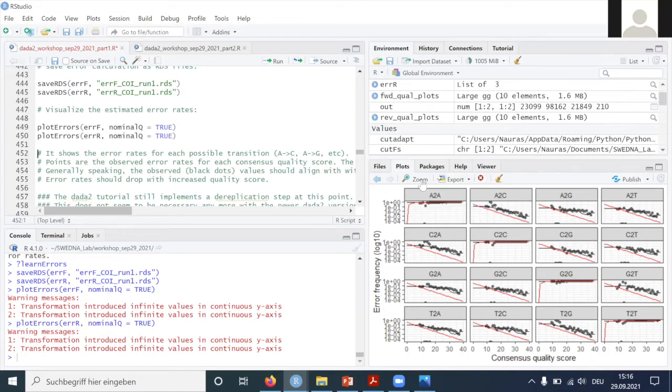I've looked at them. You're absolutely right, no one actually ever reports this, but I think it's critical to at least check it out. My guess is that you've only run one sample here. So the error model is estimated much more accurately when you have the whole run, which is why I've tried to investigate your estimations if you split out a sequencing run into different projects and correct them separately. I've never found, if I have a big enough run, that I deviate too much from the expected error model.